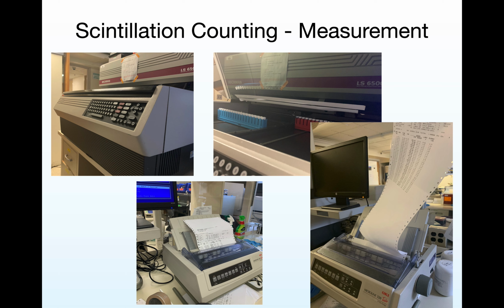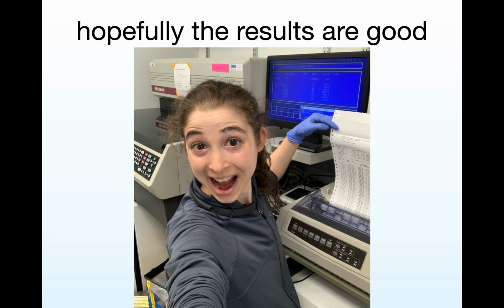But anyway, you get this long thing of results, and then you can calculate based on the ATP signal of just that ATP master mix you spotted, how much of your substrate you spotted, and the concentration of your substrate and all sorts of things. So you have to do some calculations. But then you could work out stoichiometry if you're doing an endpoint, so how many phosphorylation sites per molecule, or the activity, so how fast and well the kinase is actually working on that substrate, and if you did an inhibitor, did the inhibitor inhibit it. So this method's really old school, but it can be really fun, and it's considered the gold standard for kinase assays.